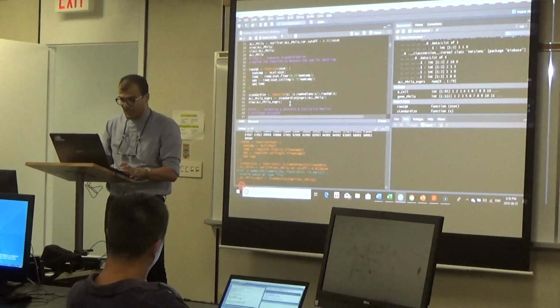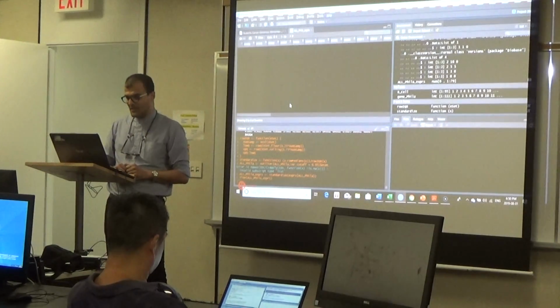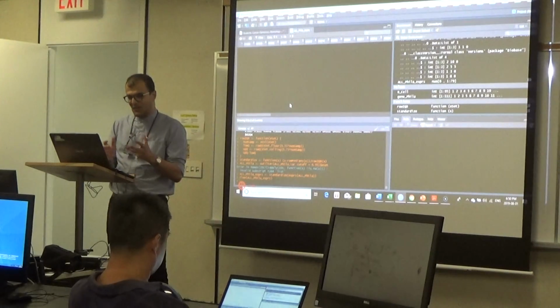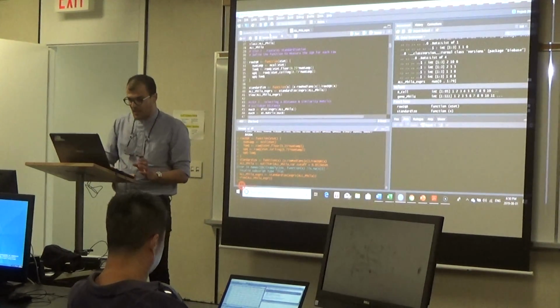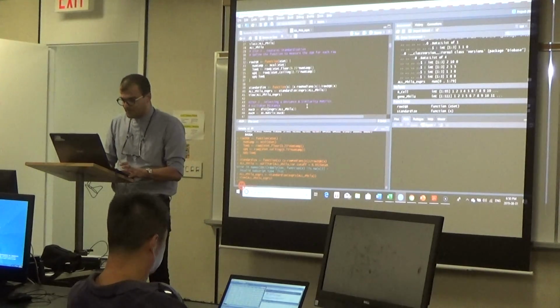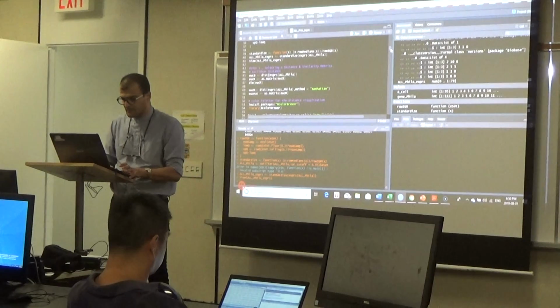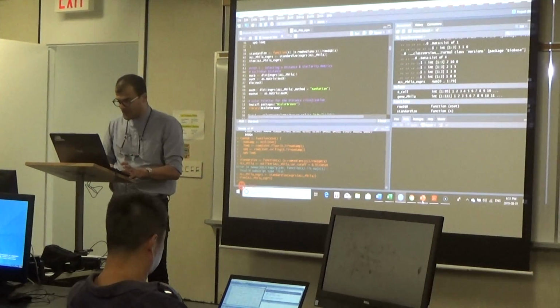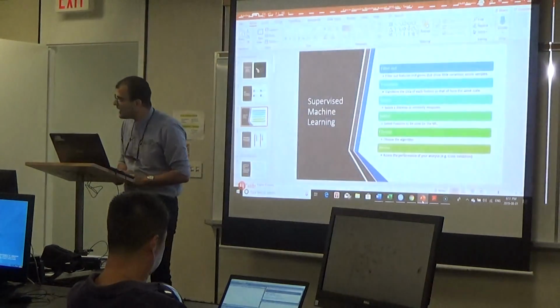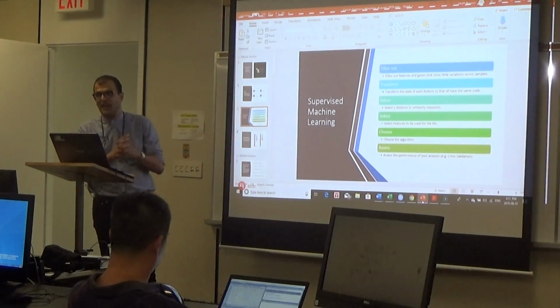We run it, and now we can also view the data sets which we have. It's going to take some time. You see that? I hope that it's working much faster for you. Okay. And now we are going to a different topic. Any questions so far? Has anybody been able to get the gene expression profile, and you can view that?